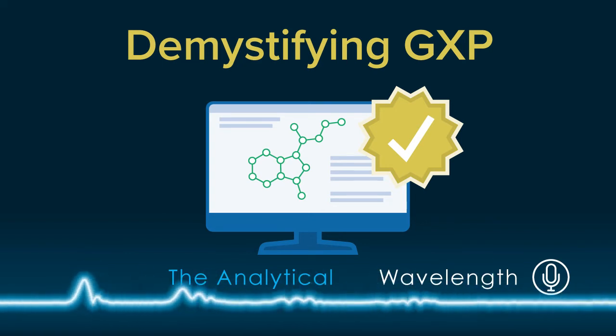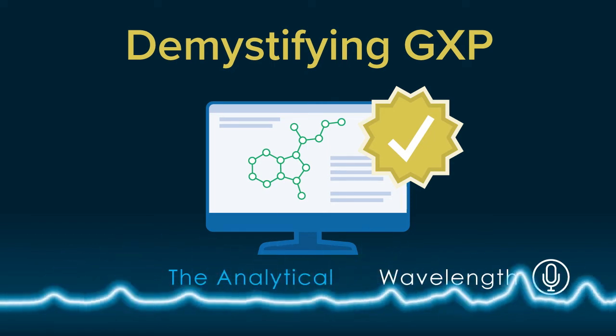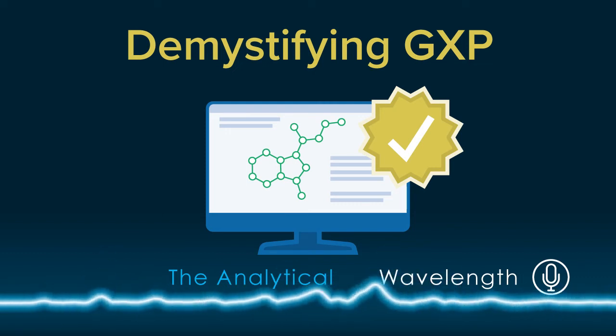Okay. Now, with that explanation of validation, GXP, and 21 CFR Part 11 compliance, are these just about the software, or is it also about the way they're being used? I think you mentioned this a little bit earlier, but it's a point that's worth emphasis. So as I mentioned, the software does need to be validated, and the software also has to have features that allow it to be rolled out into a GXP and 21 CFR Part 11 compliant environment.